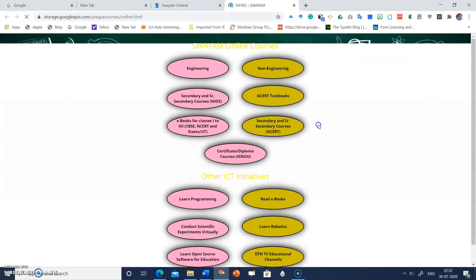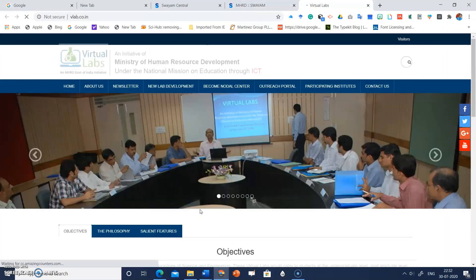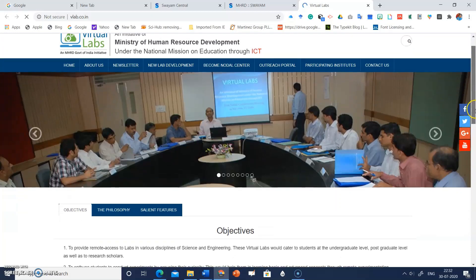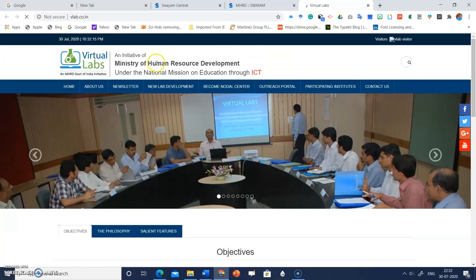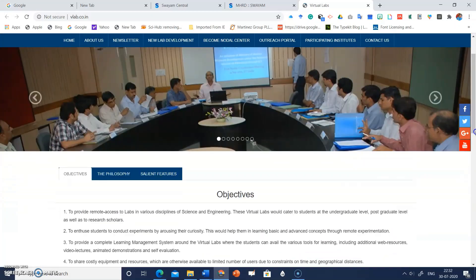This page will open. Now click on 'Conduct Scientific Experiments Virtually.' When you click here, this is the interface for virtual labs. It is an initiative by MHRD under the National Mission of Education through ICT.